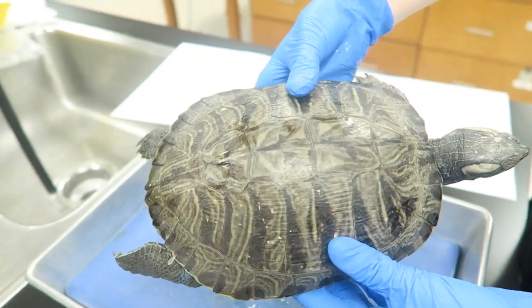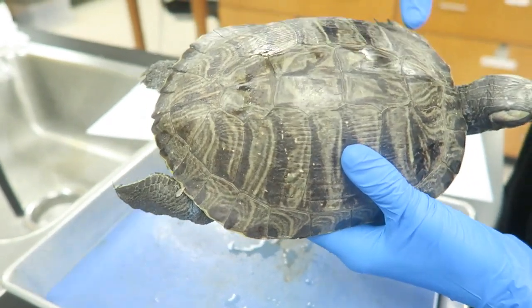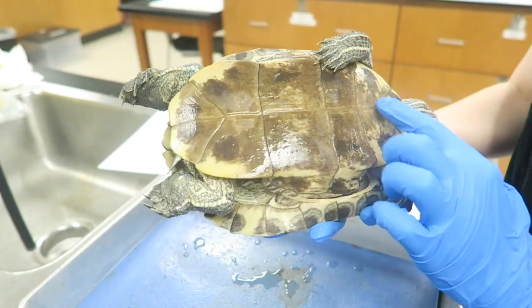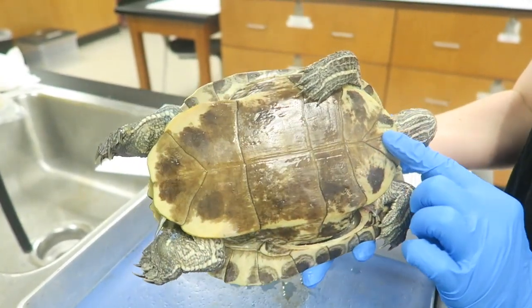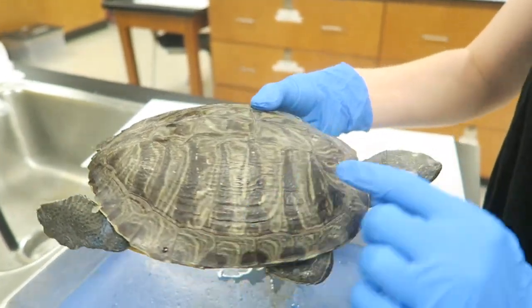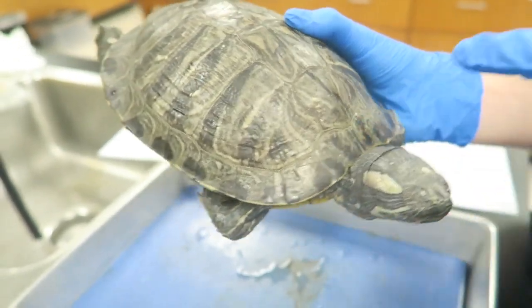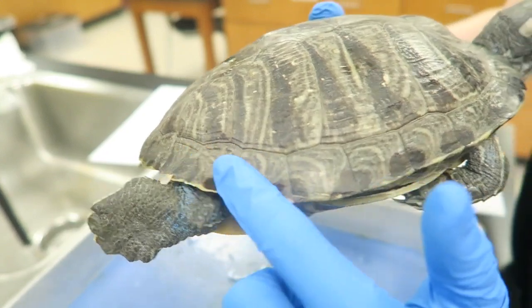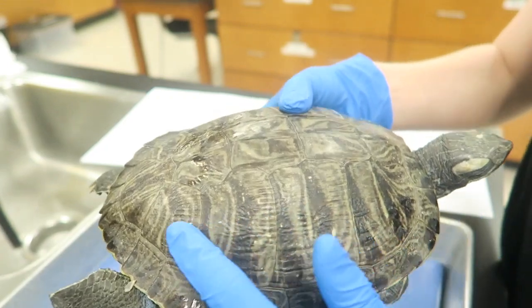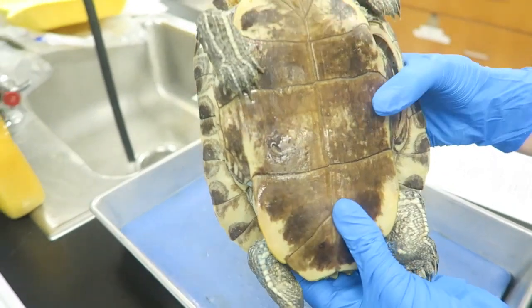Turtles have countershading, which means that the dorsal side is different from the ventral side. On this turtle, the dorsal side is a lot darker, which helps it blend in in its terrestrial environment, and the ventral side is a lot lighter, which helps it blend in when it's in the water. The most anterior scute is called the nuchal scute. The marginal scutes line the carapace, and these are the costal scutes and the vertebral scutes.